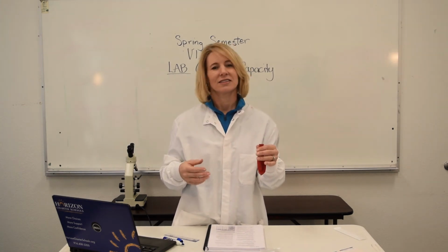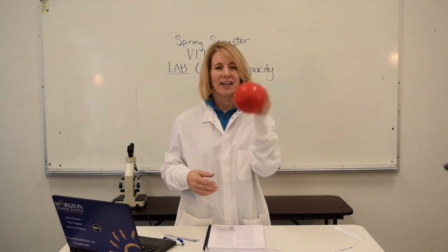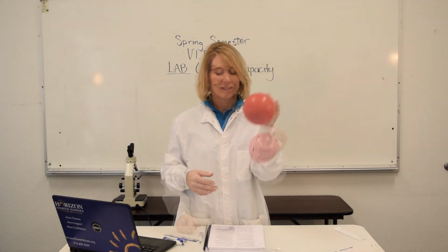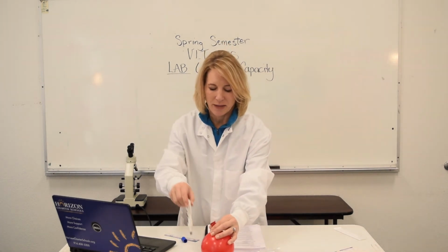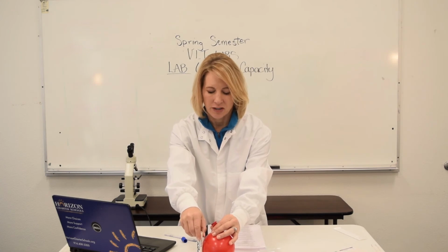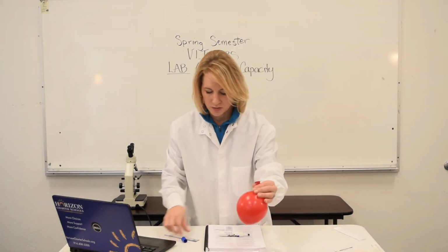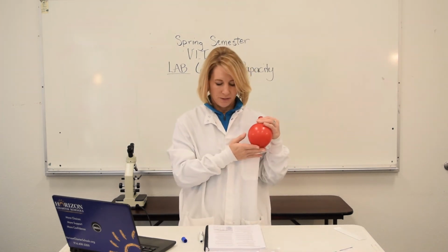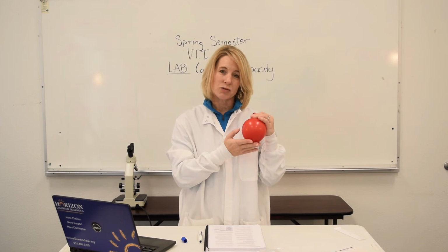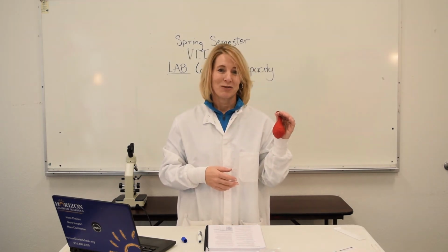So I'm just going to breathe in and out. Okay, and you can see my volume left behind is much smaller. So this is your volume that's left behind in your balloon, and so you're just going to use your pen and mark straight down here and mark it on one side and then mark it on the other side and then measure the distance between those 2 points to identify how much volume you have left behind in your lungs. And that's the expiratory reserve. You're going to repeat that 4 more times for a total of 5 trials again, and that completes our reserves.